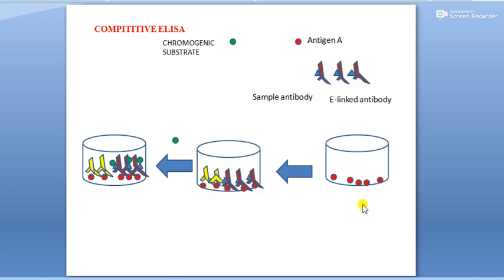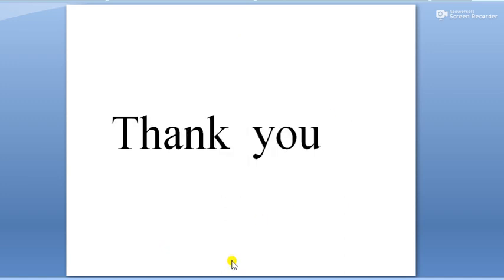So that's all for this ELISA. It includes competitive ELISA, sandwich ELISA, direct ELISA, indirect ELISA. Hope you all are satisfied with this topic.